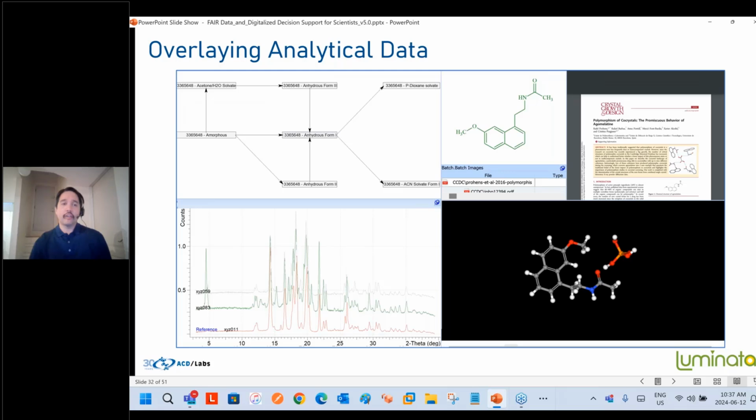Now from there, other questions that may come up is, well, can I do any of the comparative browsing that you mentioned before, especially with the studies that you saw? Same techniques, that capability of just comparing differing forms and clicking any of the boxes to say, what are the differences when I look at XRPD data? So overlaying the results, getting a better understanding, and making that very easy for any members of the team and in the solid state team to really understand further what's occurring. Collaborating, sharing knowledge is the crucial thing that we've seen in really the last decade.